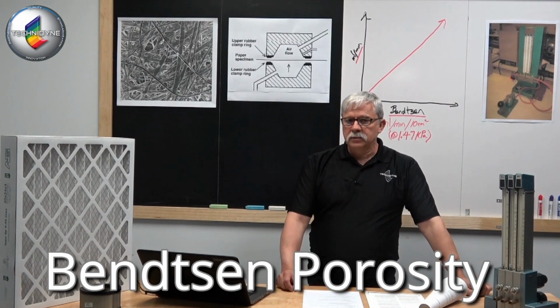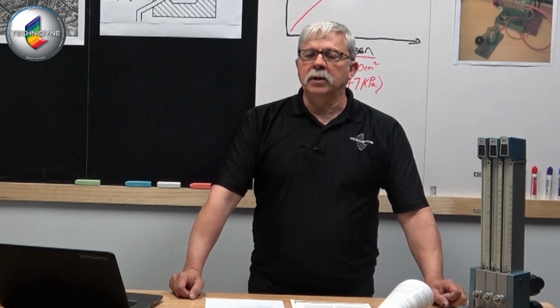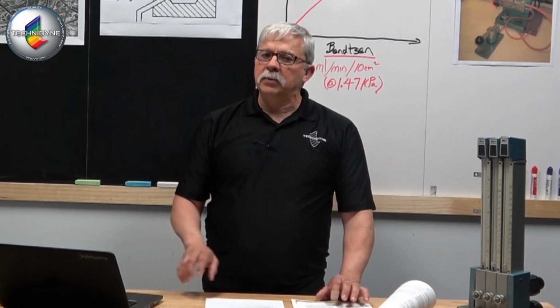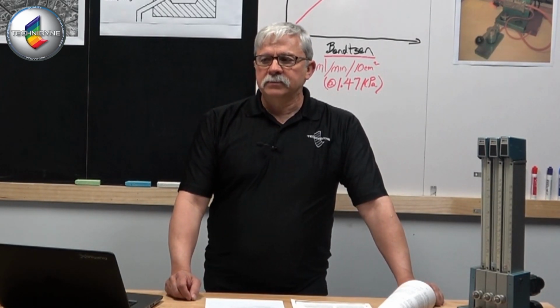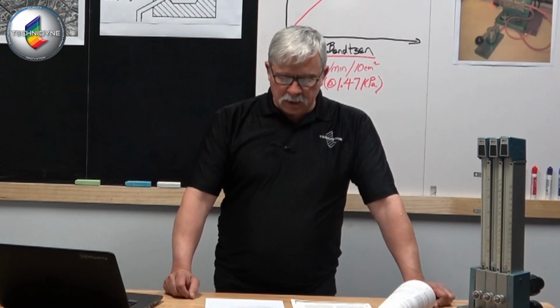This particular test was developed sometime in the late 30s, early 40s. It became fairly popular in Europe, maybe some Canadian areas as well. Not too popular here in the United States, but today we're in a very global marketplace, so anybody exporting is probably going to have to have some general knowledge of what the Bendtsen test is all about.